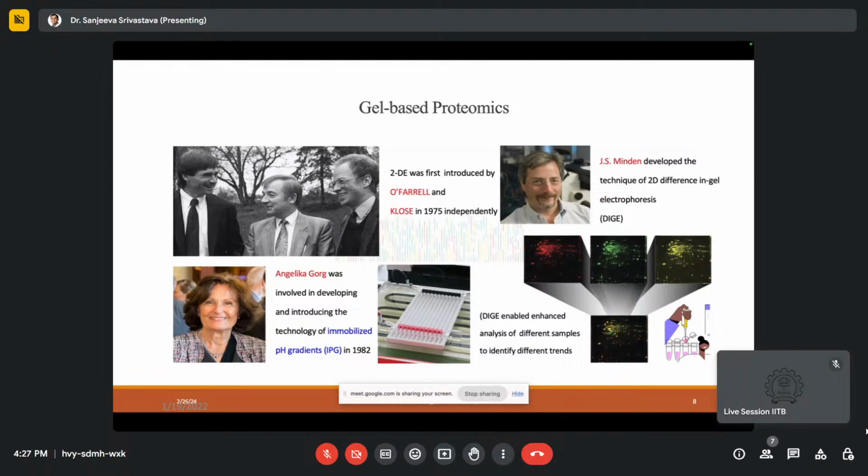So again, the gel can give you a good profile first hand to know whether the proteins are separated uniformly, or whether there are some abundant proteins or interferences affecting the quality. And once you do that, if you now want to do proteomics and identify the proteins, you can simply take the entire lane of the SDS-PAGE and chop it down into maybe 10 to 15 pieces, right? That entire gel. And each gel piece, you can proceed for in-gel digestion.